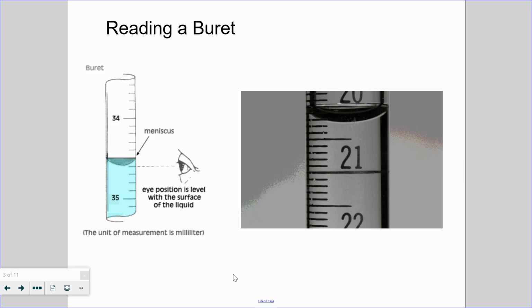Remember, a graduated cylinder would have at the top, let's say it's a 50 milliliter graduated cylinder, 50 milliliters here. It would have like 25 here, right? It would have like one, right here. So as you go down in a graduated cylinder, the volume markings get smaller.